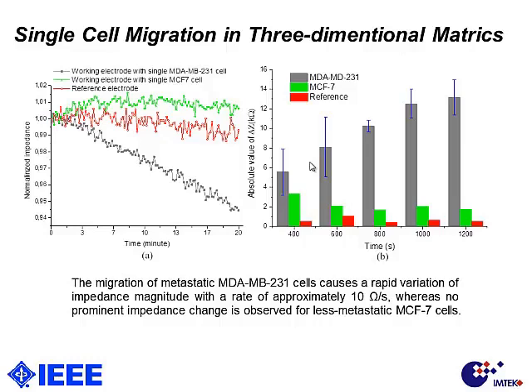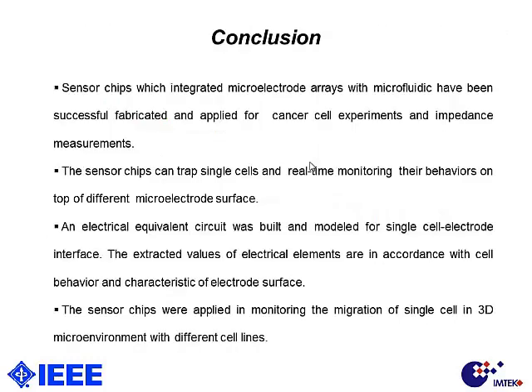So here is some conclusion of our work. Our chip can detect single cells, and can monitor in real time in the 2D culture system and in the 3D culture.